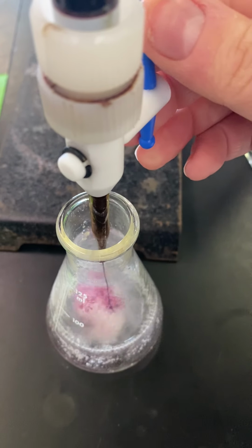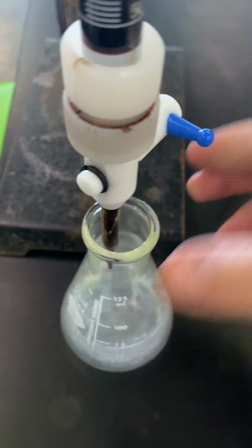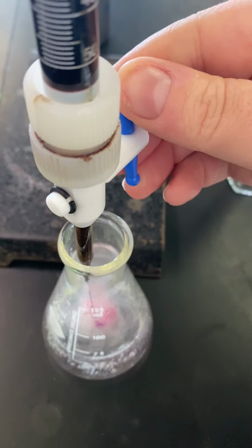Normally I would let one hand control the stopcock and one hand be swirling, but one hand right now is holding my iPhone so I can record the video.